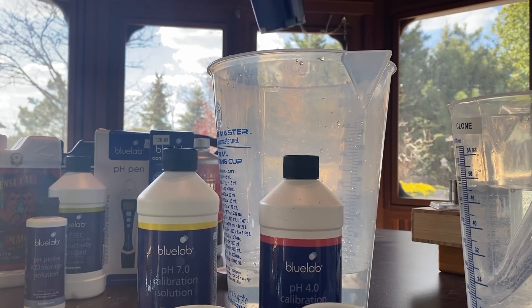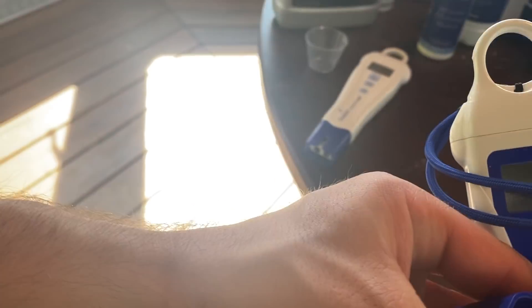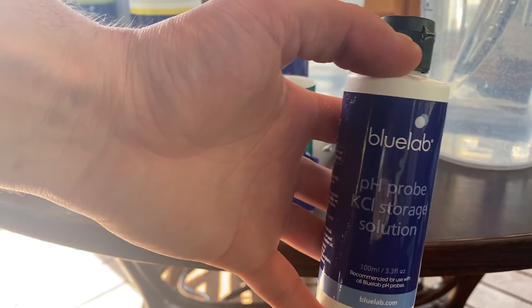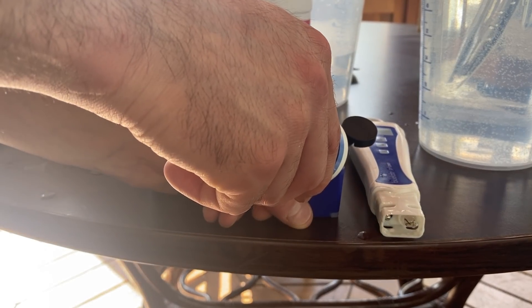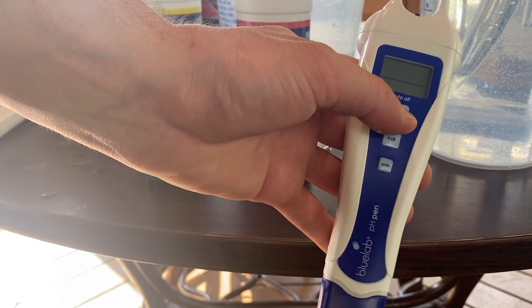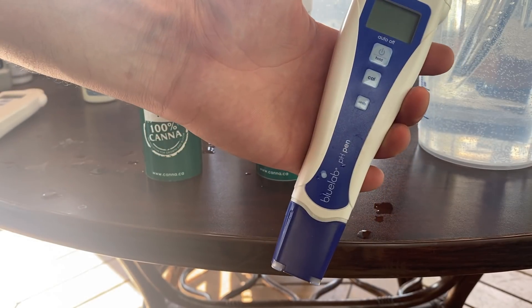Now for the soil pen as well as the pH pen, there is a solution inside the cup here. Inside the cup there's a little pocket that's meant to store the probing solution. So what you're gonna do is give it a quick little shake, pop it open, drop a few drops into the pocket. The probe inside the pH pen always has to stay moist, so just pop it in there. There you go — you're good to go guys, that's how you calibrate and maintain the Bluelab pH pen.